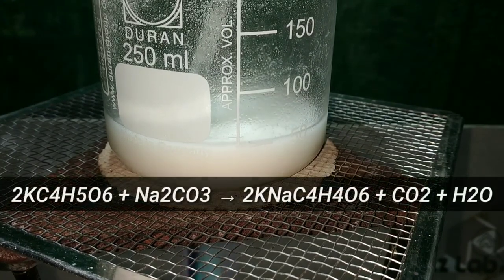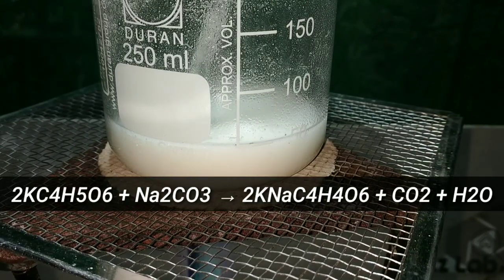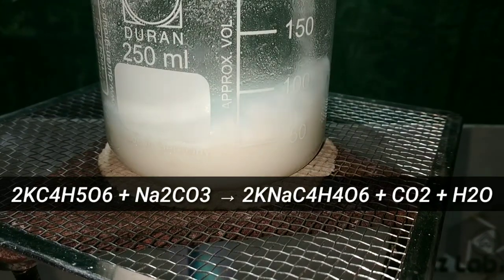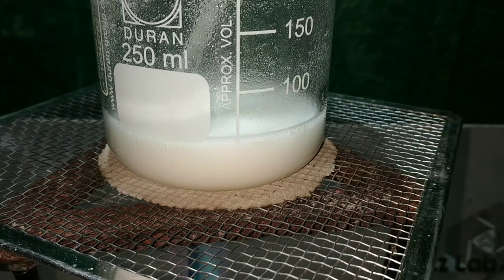What's happening here is potassium bitartarate reacts with sodium carbonate, forming sodium potassium tartarate — that is our product — along with carbon dioxide and water. Sodium potassium tartarate is soluble in water.